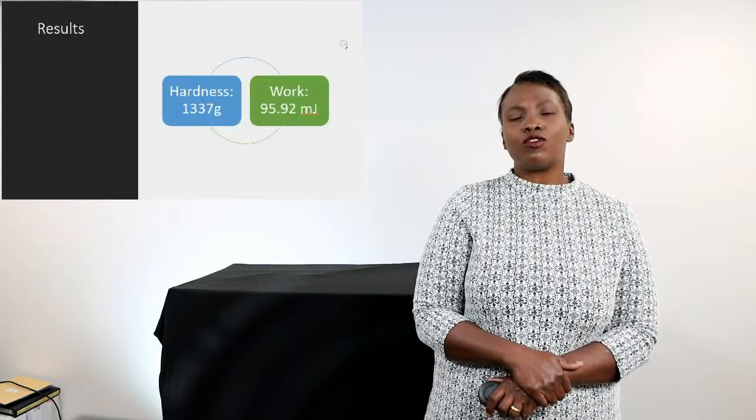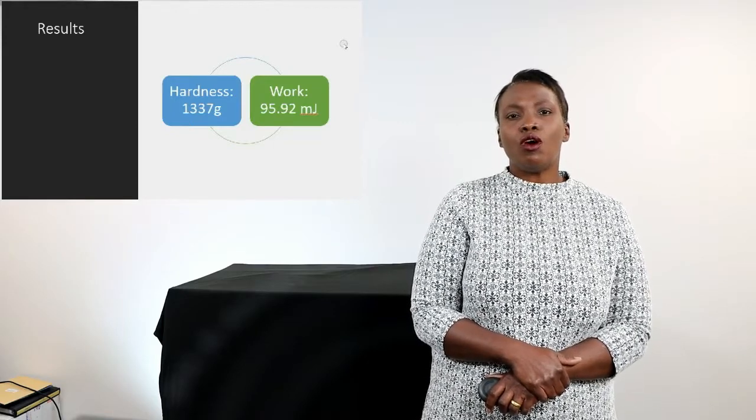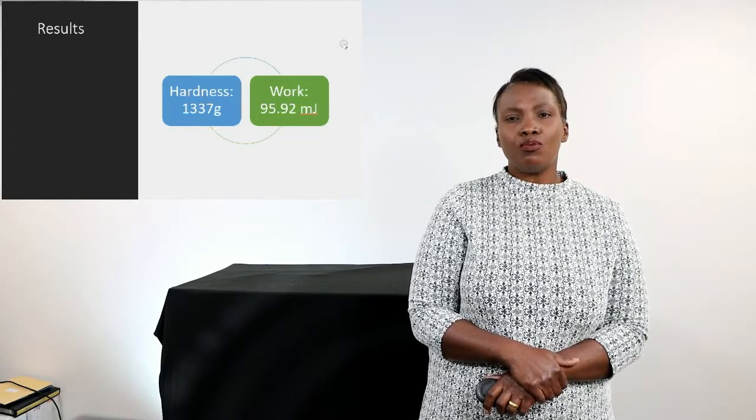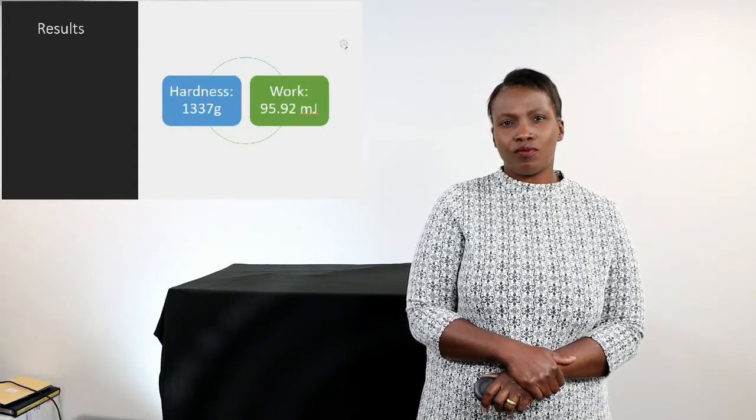Here we see the results for the bar soap for the penetration test. We have a hardness value of 1,337 grams and the work done to penetrate the sample of 95.92 millijoules.